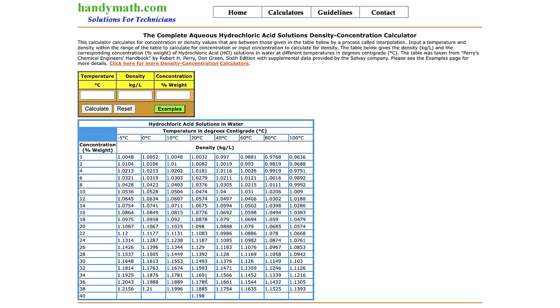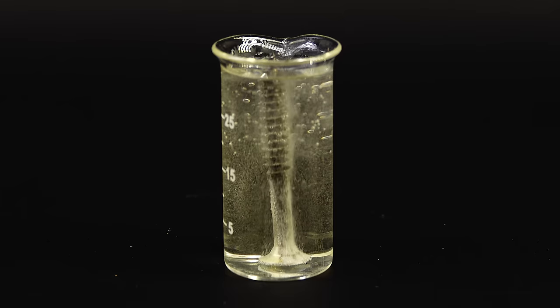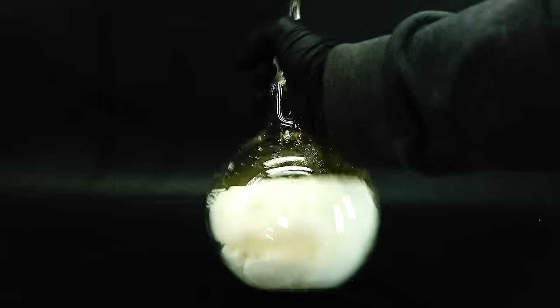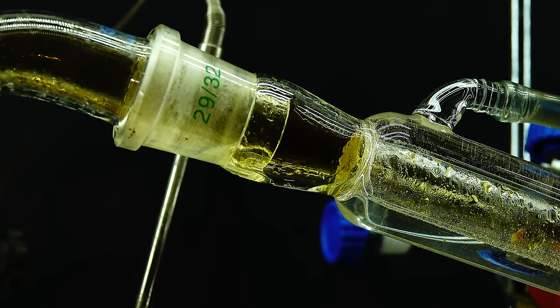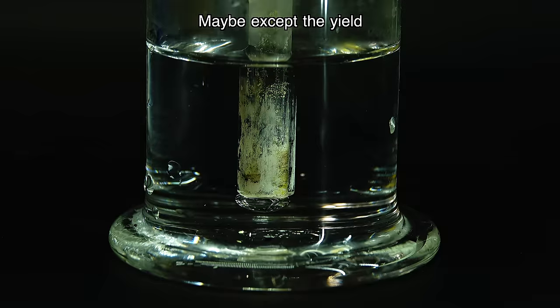When it comes to concentration, I measured it by checking its density and using a helpful online chart. It came out to be around 36%, which is incredibly good and almost as high as it gets. When it comes to purity, apart from the orange coloration which makes it look like apple juice, it should be really quite pure and suitable for a lot of reactions. It's incredibly cool that I managed to make some really strong acid from just some random pool chemical and table salt. The whole process is a really good demonstration of the properties and behaviors that apply to many acids, and overall I am really happy with how it went.